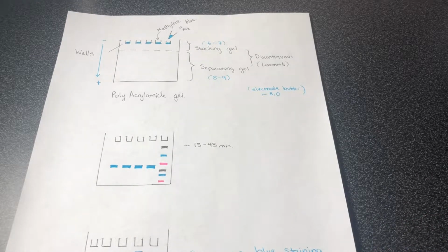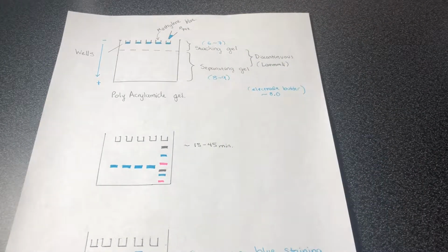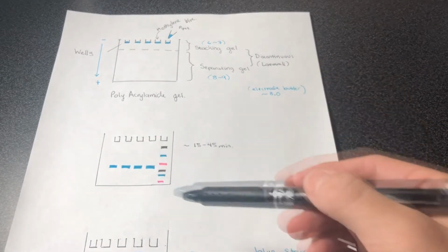Now note that this is not actually 300, 400. Why? Because methylene blue flows faster than all the proteins. The proteins have different size charges. So actually you can't see the protein in here. You don't know where it is. But this gives us a good reference point.